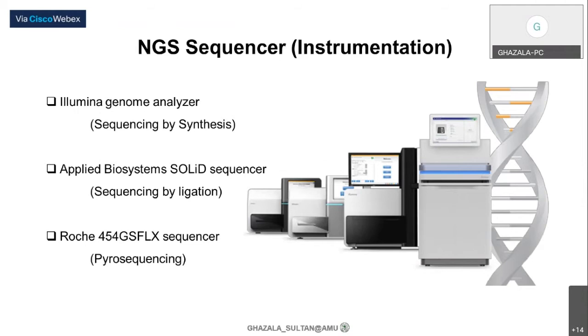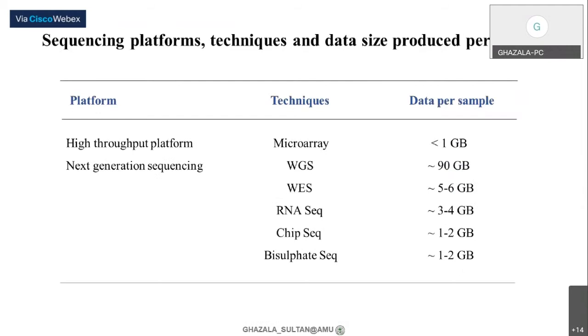The first step is sequencing itself, but once the sequencing is done, what do we need to do with the data, and what kind of data is generated? That we will check in this lecture. We have different platforms for sequencing, and we can see the data size: a huge amount of data is generated from next generation sequencing. So we need to see how to deal with this data, what different tools there are, and the databases where these tools are available, so that we can get the data and analyze it, and further relate it to the clinical setup and implement that information when handling the data.